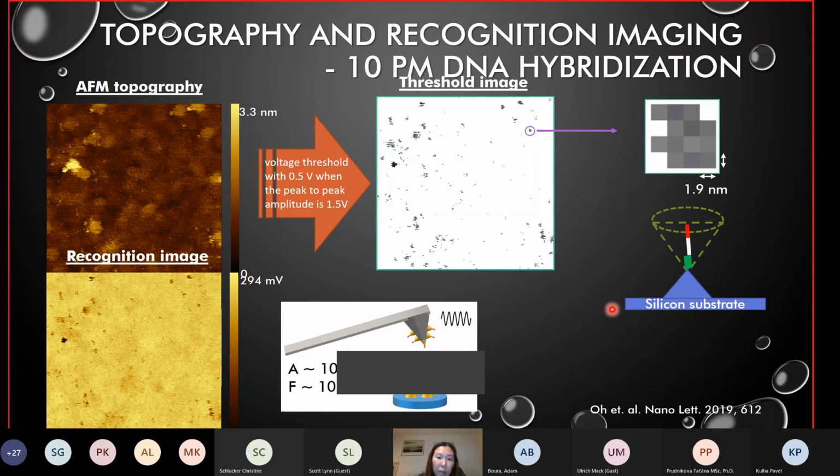The main advantage of using TREC is that it is the same as using just tapping mode, the normal imaging mode. The time of one map, one image, is about 4 minutes. So time-wise, we could really make it faster, from 70 minutes to 4 minutes. And also we can increase our pixel number. Previously, each pixel cost time in our case, which is not the case now.